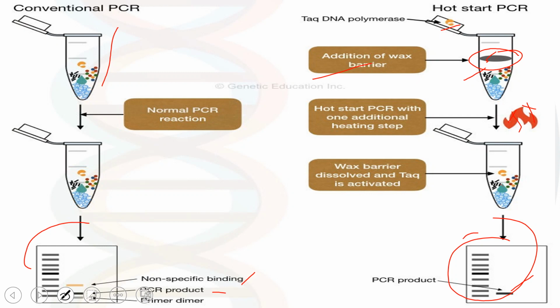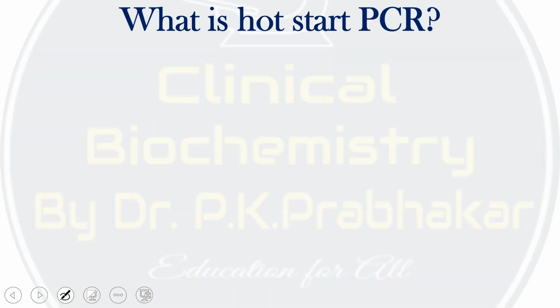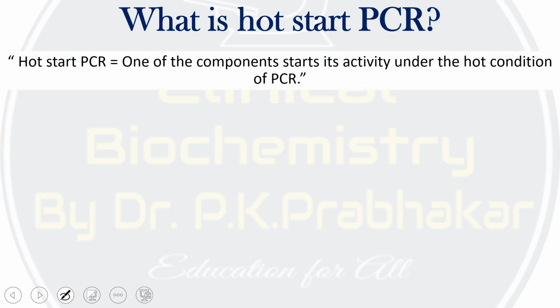We have many methods by which we can achieve this process. So we will see exactly what hot start PCR is. Hot start PCR means that one of the components starts its activity under the hot condition of PCR.